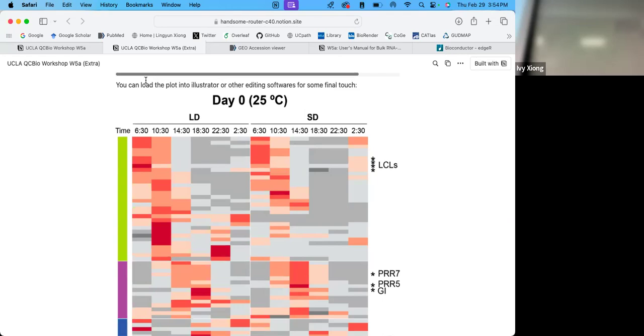It's the first time we've done that as well, because the last time, or maybe that was what we were doing last time, it was specified as not. Maybe it wasn't anything. I thought it was looking at the file as old. It takes a second, like 2 seconds. Yeah, just change the name. I think my problem here is the picture, but it looks like a brand new output file.